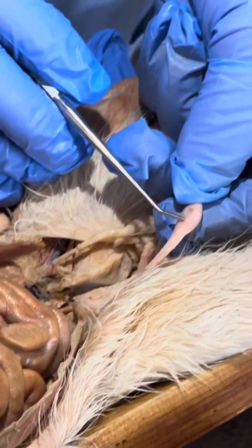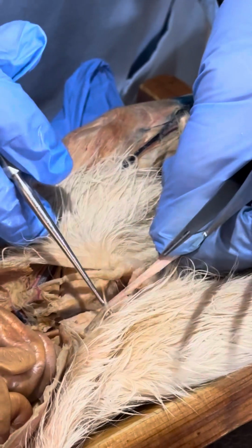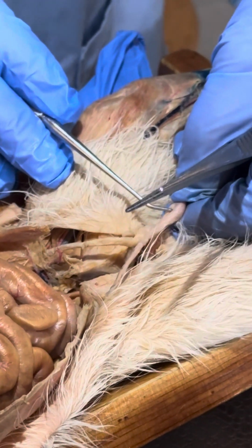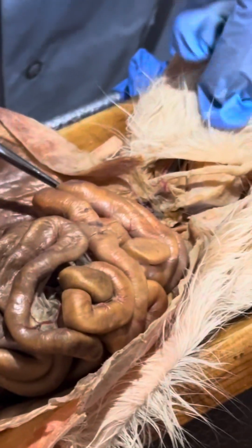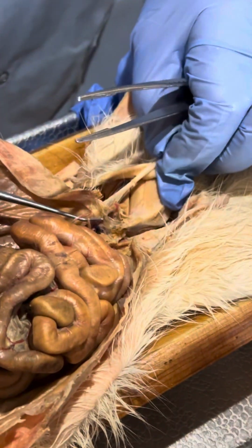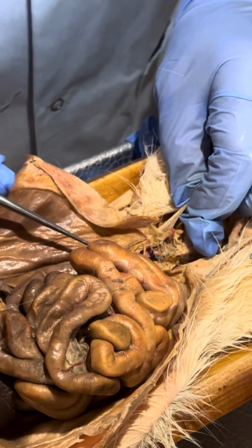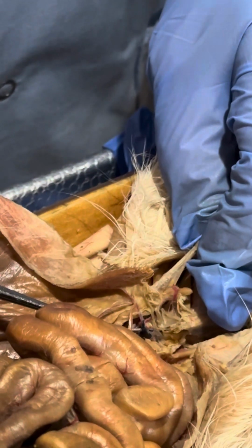So this is the fascial sac covering the testicle. And then this is the spermatic cord, and it's covered by spermatic fascia. Remember, the spermatic cord has the cremaster muscle, and the fascial sac does not. And then if you look up inside the body, like right here, we can see all the structures that go through that inguinal canal. So we have the internal spermatic artery and vein, and then we have the vas deferens. And once they get inside the body cavity, they go their separate ways.